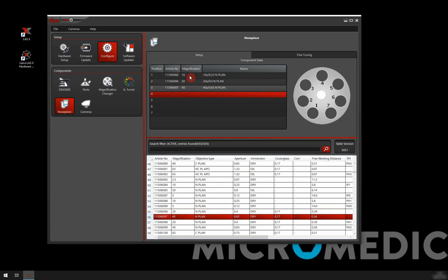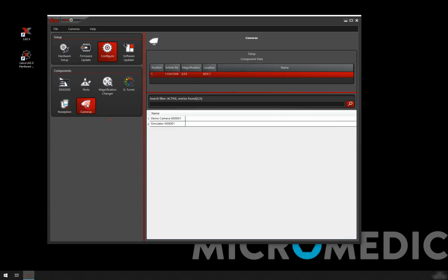So we are almost done. Now we're going to add the camera. So we're going to the camera. In here we can see that it's already with the 0.55 documentation port adapter that we added in ports.